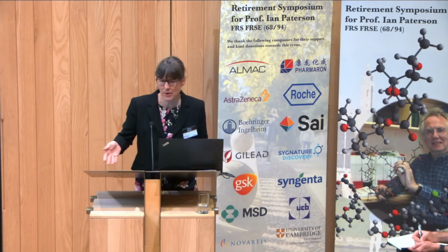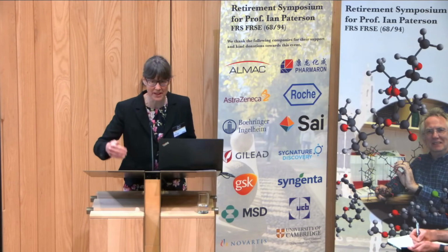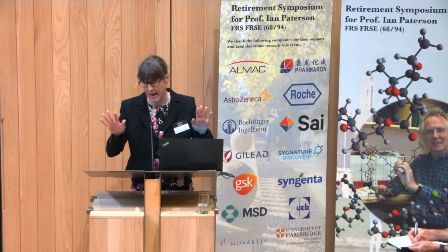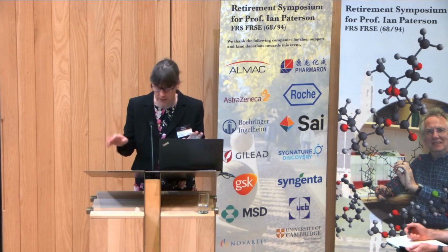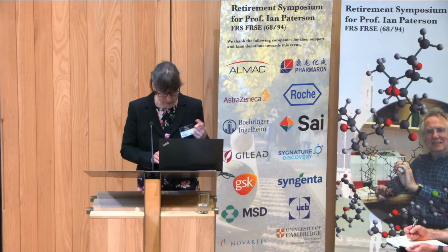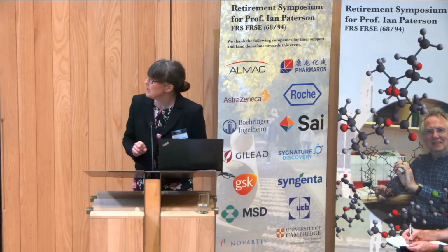So I literally went to my colleagues in cancer biology, to Val, and said, we should work with this compound because this compound has an alkyne flanked by 2 aryls, and so it's really polarizable, and so we're going to get an enhanced signal. We know we're going to get an enhanced signal. And it comes at 2221, sorry, and so we can start to image it.